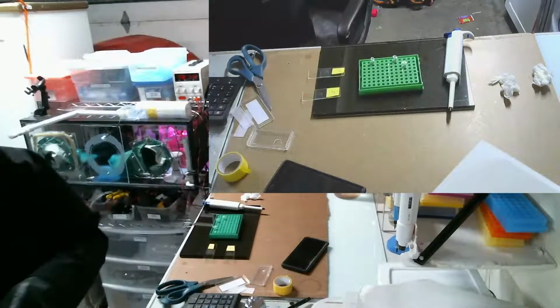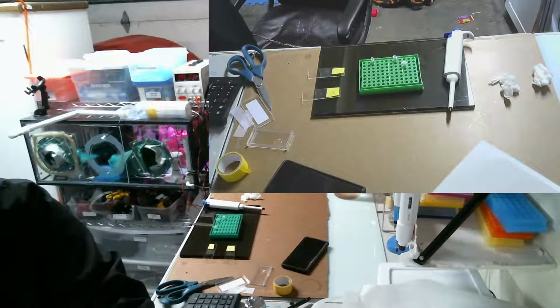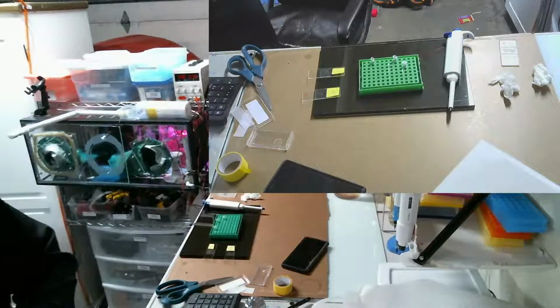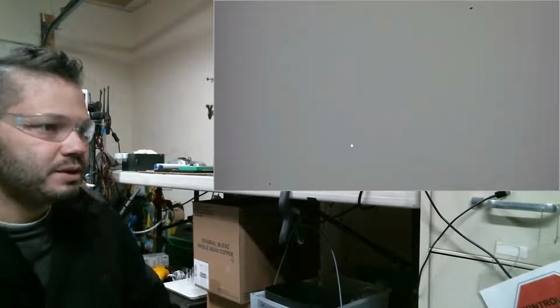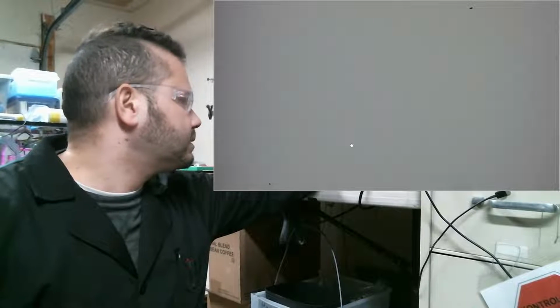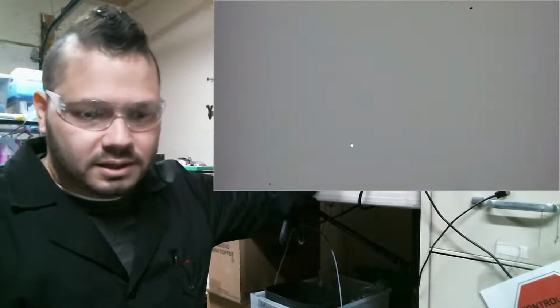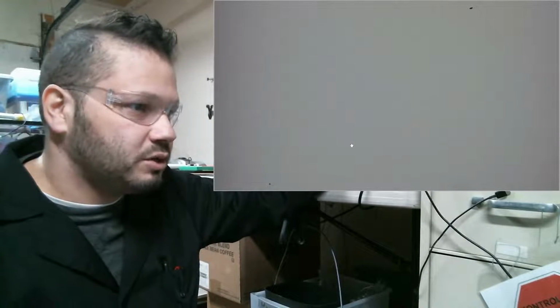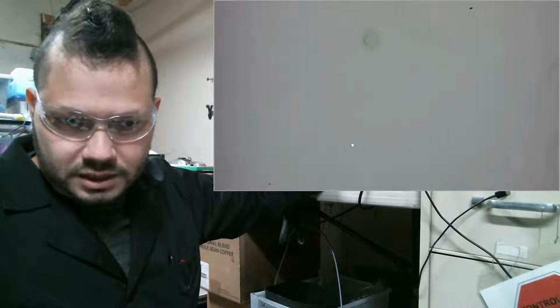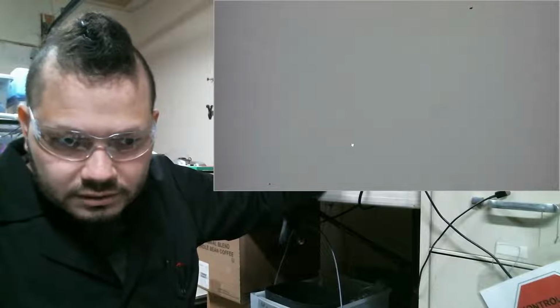Now we're going to look at the indole acetic. Now this is where my program is really cool here. Not my program, I didn't design it, the AmScope program, because I can actually take pictures if I have something to take pictures of.